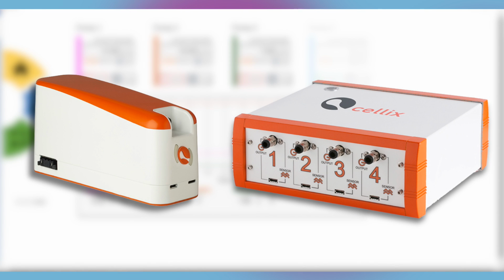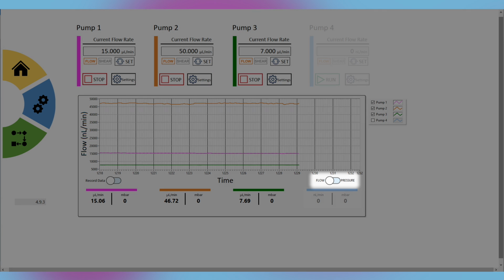When running a Unigo or 4U pump, it's possible to switch the feedback units between flow units and pressure units. To switch units, click on the flow and pressure switch within the Manual tab.